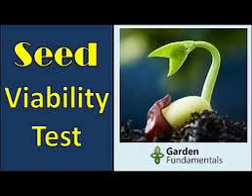Criteria for selection of a seed vigor testing method. Two different criteria have been employed by the Seed Vigor Committee of ISTA, the International Seed Testing Association, to evaluate the performance of seed vigor test methods for different crops. First, reproducibility of the vigor method. Second, the relationship between vigor test results and seedling emergence in field soil. There is no universally accepted vigor test for all kinds of seeds.